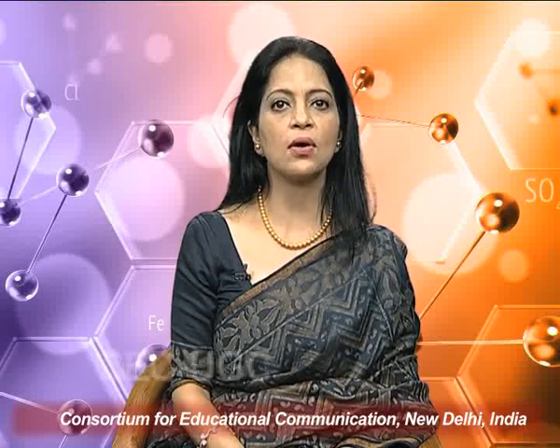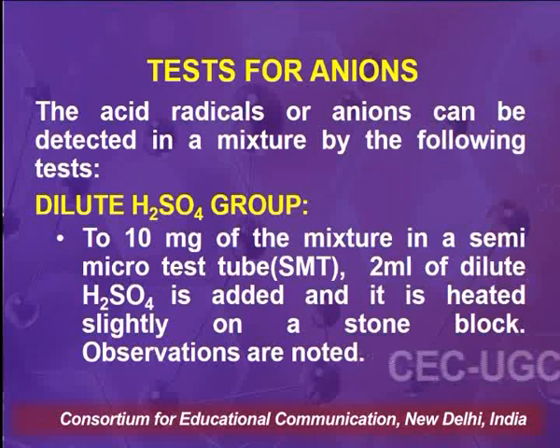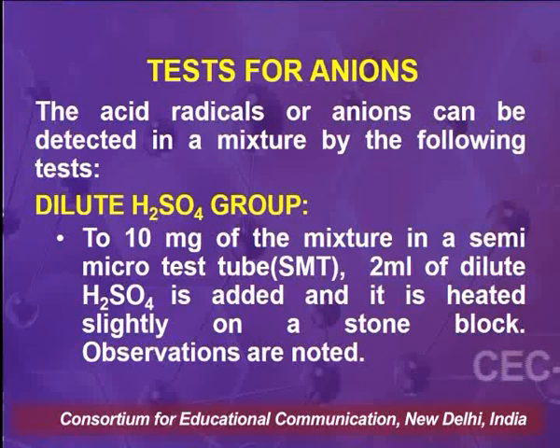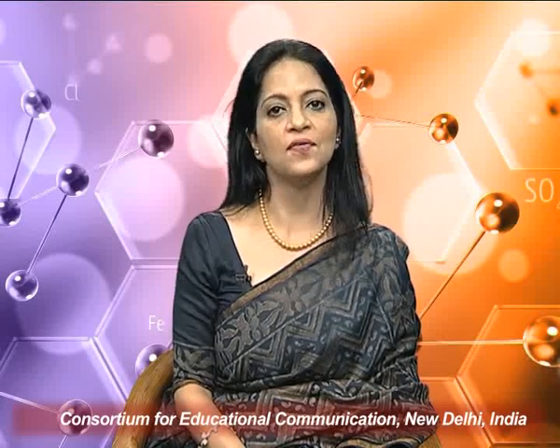So considering the test for anions, the acid radicals or anions can be detected in the mixture by the following tests. As described earlier, the first one is the dilute sulfuric acid group. In this case, to 10 mg of the mixture in a semi-micro test tube, which is given as SMT, 2 ml of dilute sulfuric acid is added and it is heated slightly on a stone block. Stone block is an alternative to the flame or a wire gauze as in the case of a semi-micro analysis. And after this, the observations are noted.